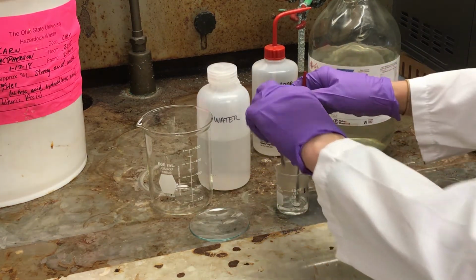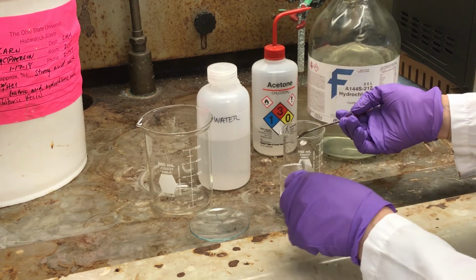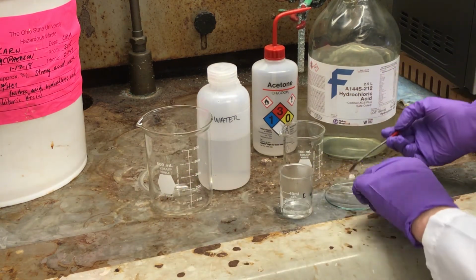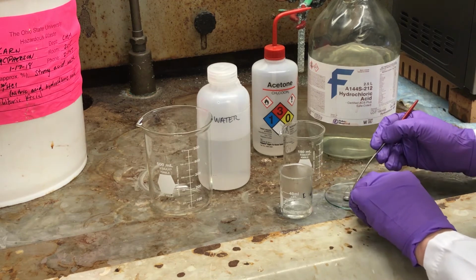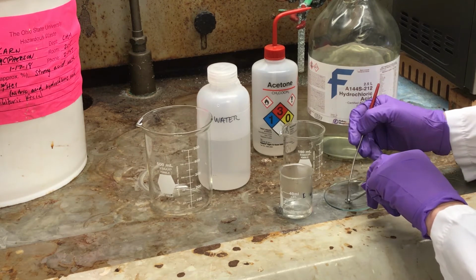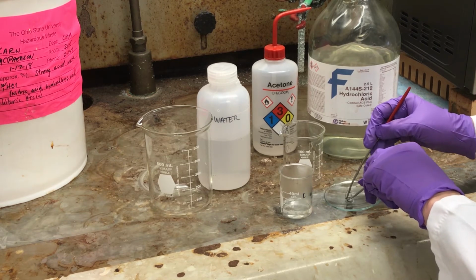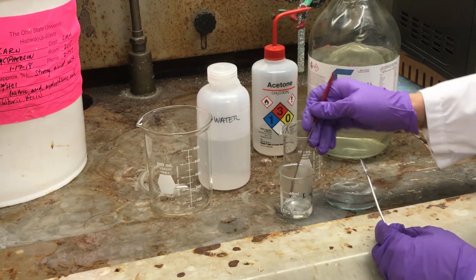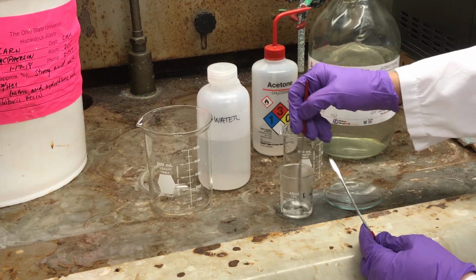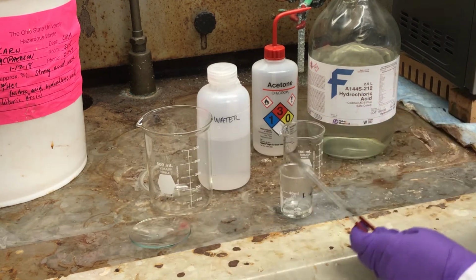Sometimes you'll find that there's something stuck on the platinum pan. And if that's the case, what you can do is very carefully take the pan out, put it on a watch glass, and gently, very gently scrape the pan. It's going to take a little bit of manipulation, but just some gentle scraping. I'm not pushing hard at all. These platinum pans can be damaged relatively easily, and they're very expensive. So a little bit of scraping, maybe, but definitely some soaking in the hydrochloric acid should take care of anything on the sample pan that you don't want to be there.